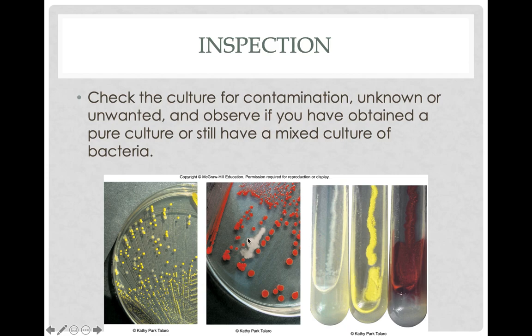You can't use this plate. It's messed up. It's useless. Whereas over here, all one color, all looks the same. These are the same. It's mixed cultures over here, pure cultures over here. So you need to inspect it to make sure that what you see is what you really want to see.